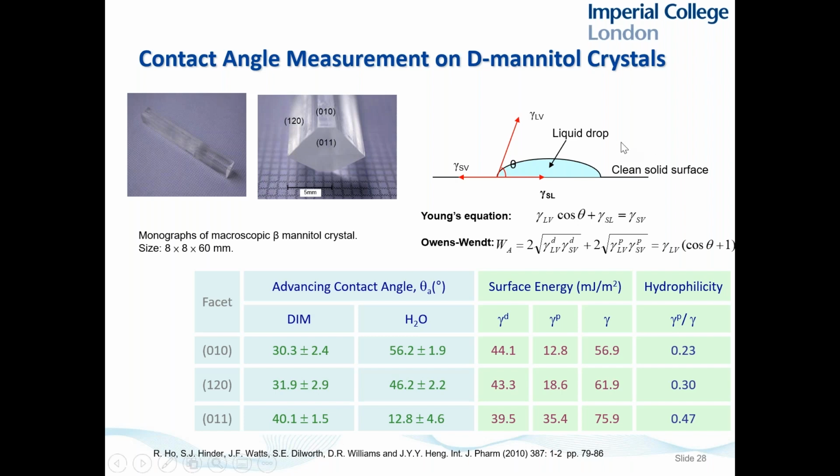And the angle that the droplet makes on the crystal surfaces allows us to determine the surface energy using contact angle measurements. So this tells us about the long-range forces. Water is a very hydrophilic polar molecule. It tells us about the short-range forces.